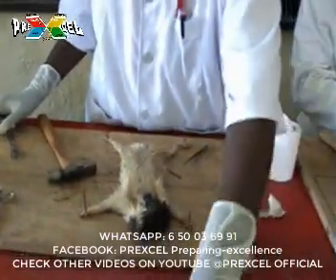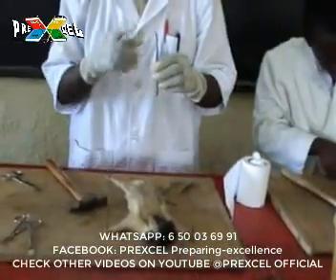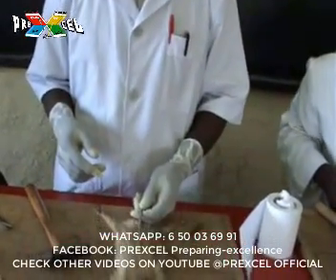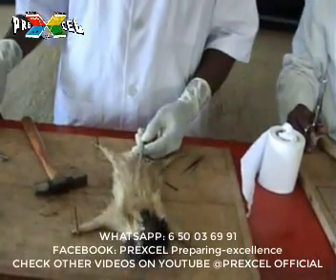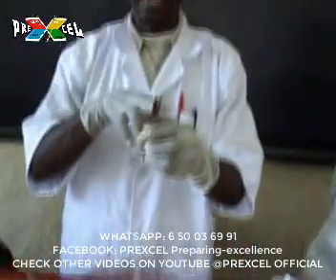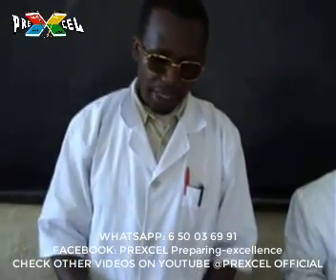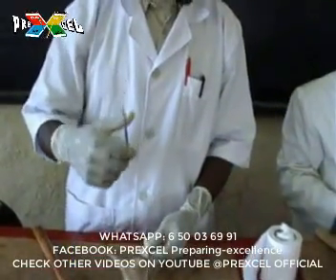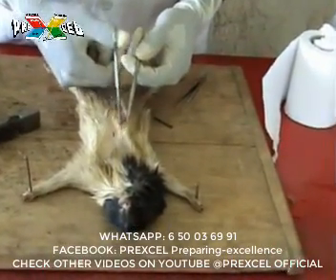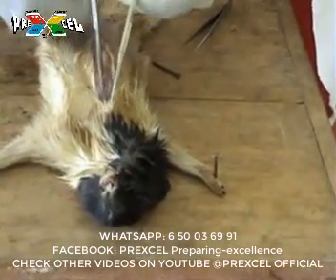When you make this incision, you will be required to use a probe from your dissecting set — a blunt-ended probe. You put this probe inside the incision you have made. The abdomen is made of two walls. You then use scissors that has one bluntly-ended end and one sharp end, holding it so the blunt edge goes inside and the sharp edge remains outside. You then cut a straight line upward, with the probe directing you where to go, and the blunt end of the scissors cutting without destroying the tissues inside.